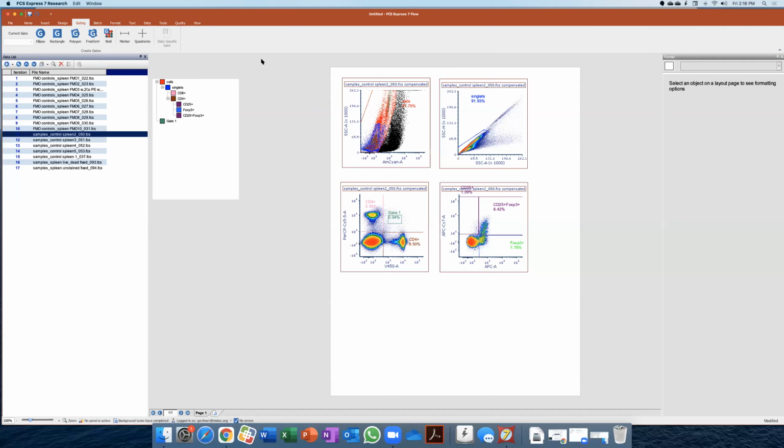So the important thing is there are going to be differences in the instrument and the samples and potentially the reagents from day to day. So if you're running the same exact experiment or the same panel on different days, if that's how I'm interpreting this question, you want to make sure that you're running the appropriate controls each and every time. It's important to run the unstained, the single colors, and the appropriate FMOs from time to time. There might be differences day to day in what those populations look like. That could be because there's some biological difference, and you want to account for that and make sure that you gate for those populations, and that's okay to do.